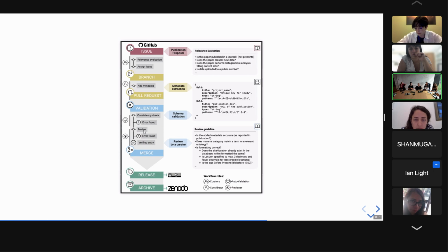So if you had, like Maxime said, a study with 10,000 samples, that would be very fine for the computer, but very difficult for the human itself. And autofill is coming in here. Let's say we keep the head of the person, and the body we replace with autofill. So part of the metadata are automatically retrieved. Yes, but keep the head, because you need to check them.